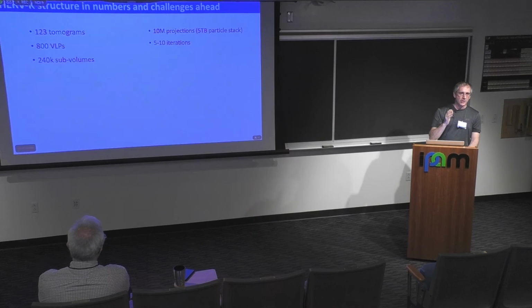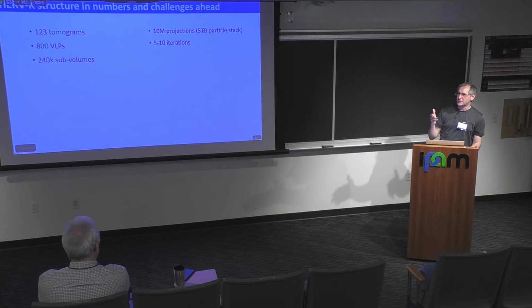Yeah, so I didn't mention that, 10 million projections, just to give you an idea, the particle stack alone is 5 terabytes, right? So just writing that much data is already going to take a lot of time, and you're going to spend a lot of time doing I/O if you don't do things carefully.